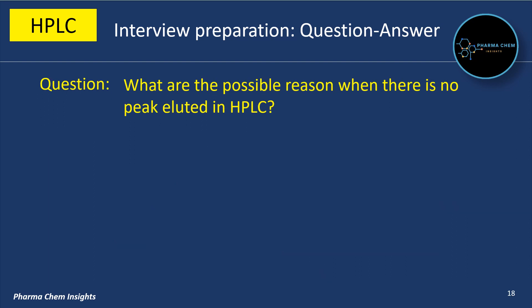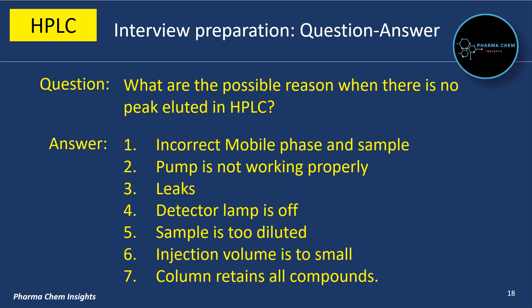What are the possible reasons when there is no peak eluted in HPLC? You can check for the following reasons: first, incorrect mobile phase and sample; second, pump is not working properly; third, there may be a leak in the system; fourth, detector lamp may be off; fifth, sample is too diluted; sixth, injection volume is too small; seventh, column retains all compounds.